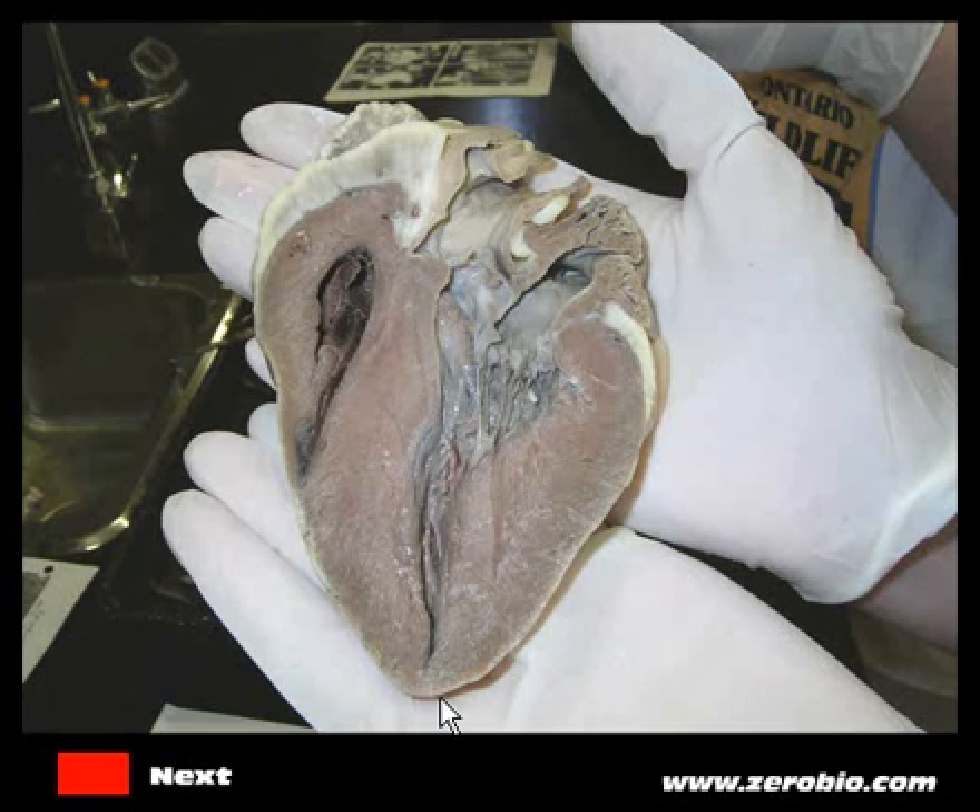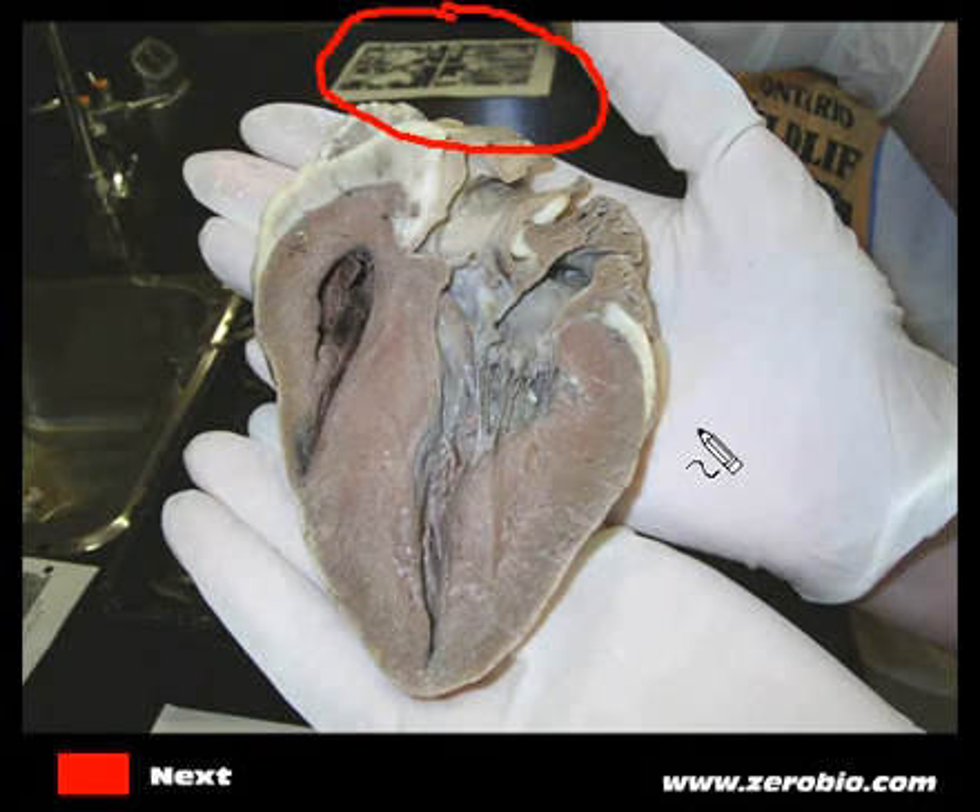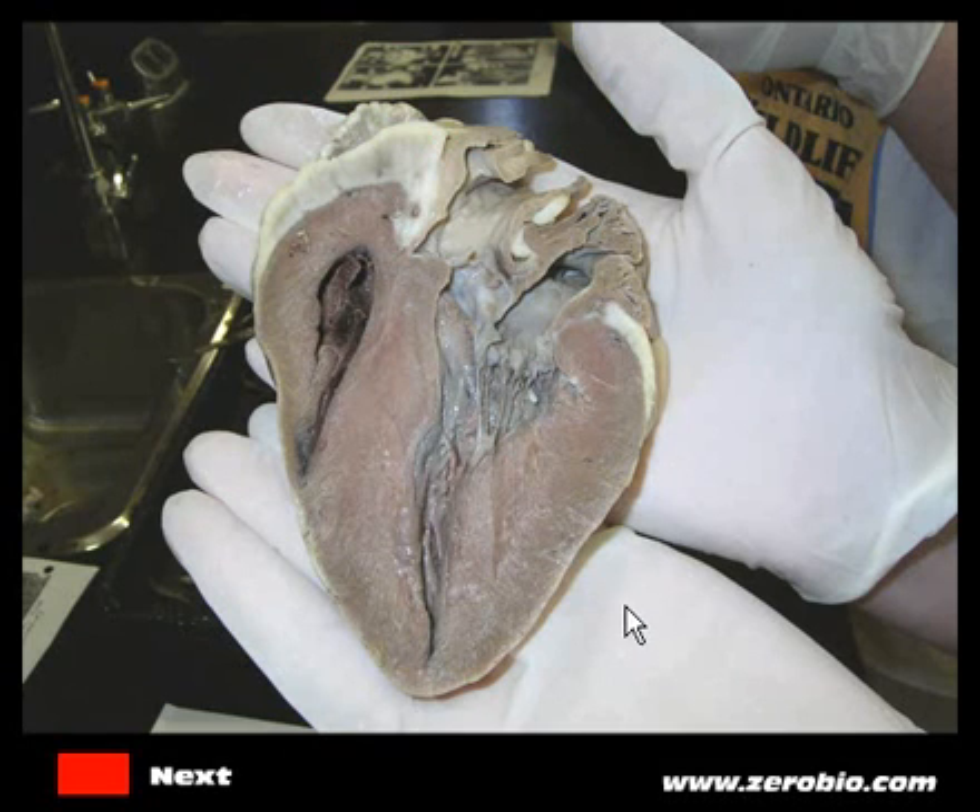Here is a nicely cut-open half of a heart. The apex is this region down here. The first thing to do is identify which side you're looking at — is this the left or the right? You can refer to the lab manual for dissection pictures. What you want to do is look at the thickness of the walls. You can see that this side is quite a bit thicker than the other side, so this thicker side is the left side with the left ventricle, and this thinner side is the right side with just a little bit of the right ventricle showing.